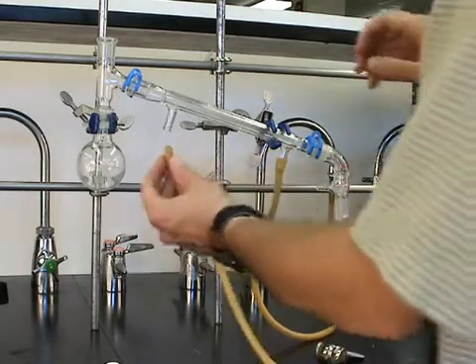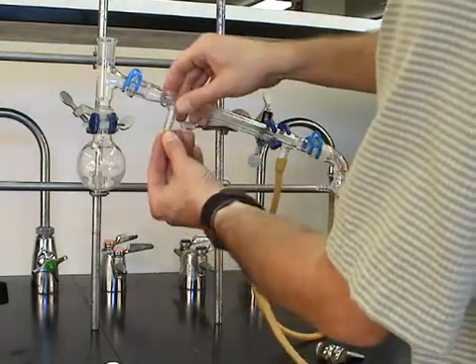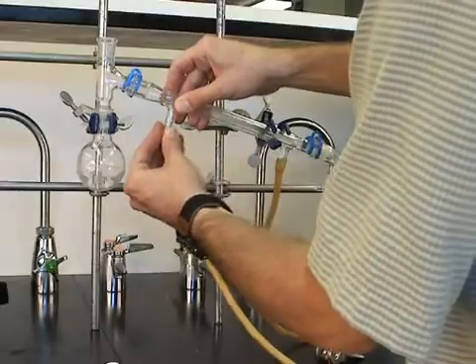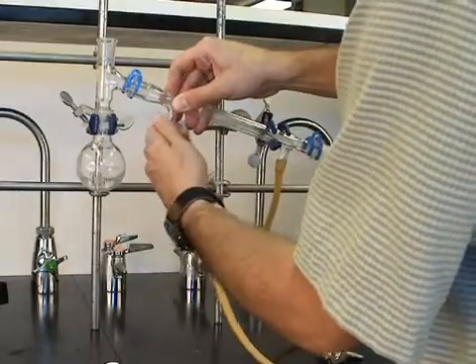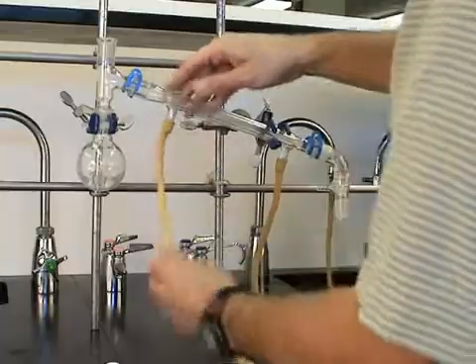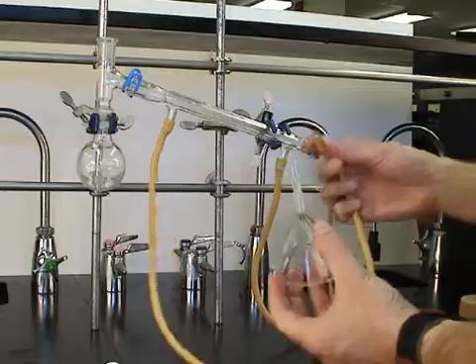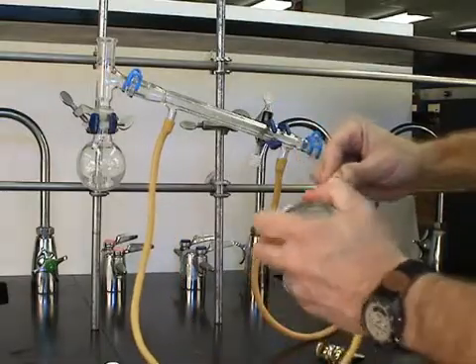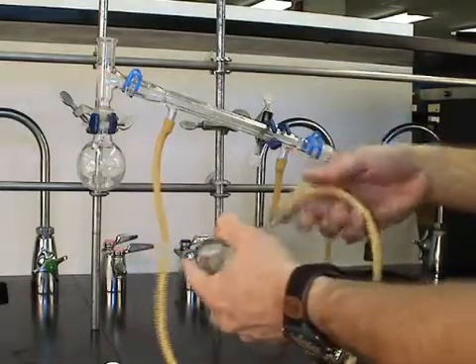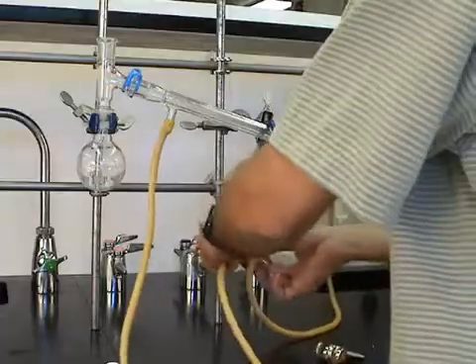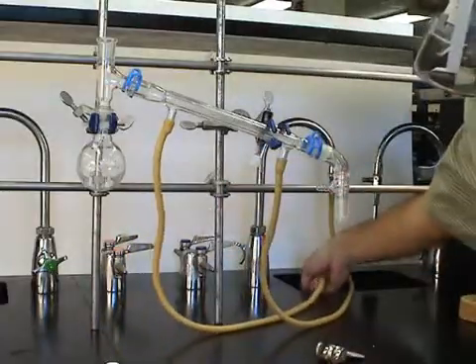A second piece of latex tubing is attached to the higher end of the condenser. And this is going to be the drain. In order to keep the hose down in the sink, we attach it to a glass stem funnel. This simply serves as a weight so that the hose doesn't accidentally come out of the sink.